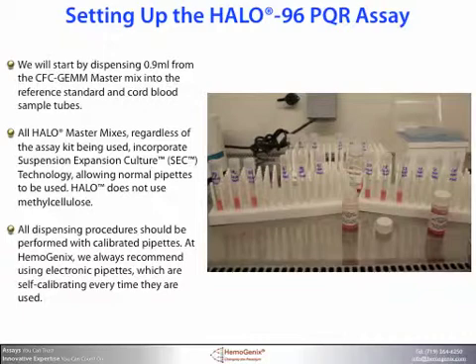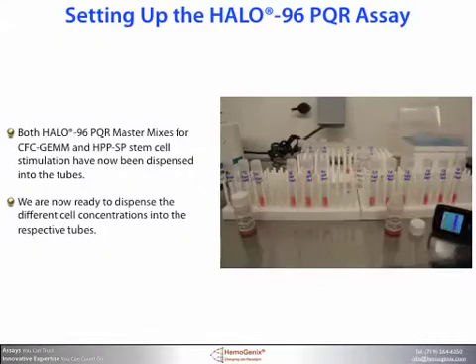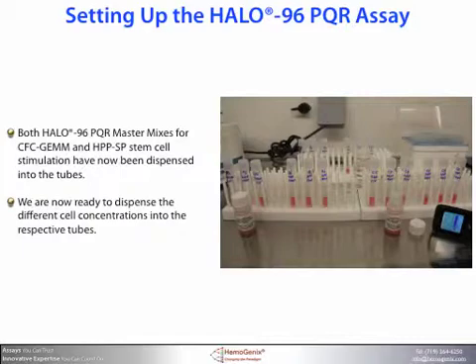We'll start by dispensing 0.9 milliliters of the CFC-GEMM master mix into the reference standard and cord blood sample tubes. All HALO master mixes, regardless of the assay kit being used, incorporate suspension expansion culture technology, allowing normal pipettes to be used for the purpose. HALO does not use methyl cellulose. All dispensing procedures should be performed with calibrated pipettes. At HEMogenics, we always recommend using electronic pipettes, which are self-calibrating every time they're used.